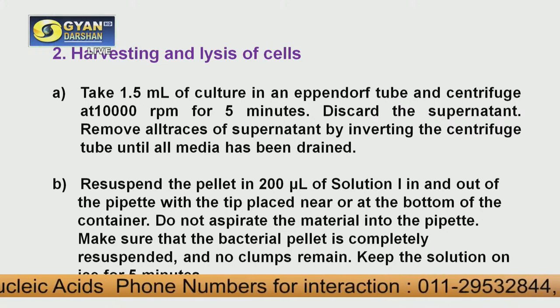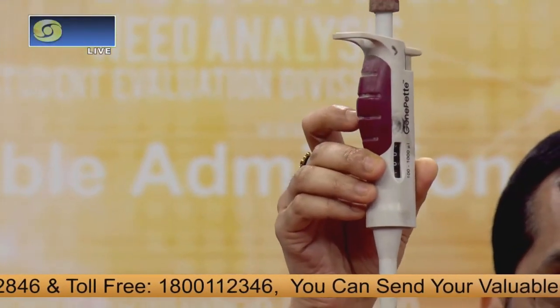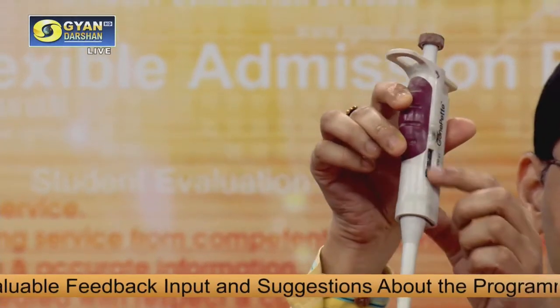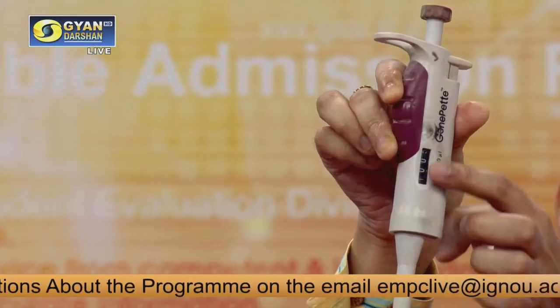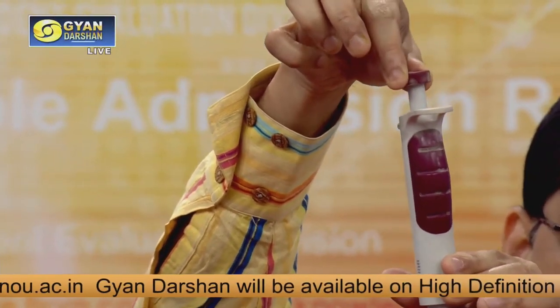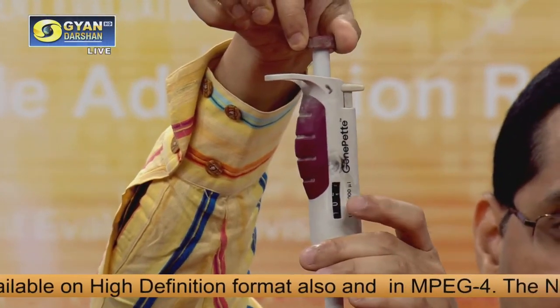Now in this context I will show you how to use this particular instrument, which we call the pipette man, or micro pipette. This is the micro pipette. You can set how much. There is a particular groove here that shows how many microliters you are pipetting. You can rotate this and set it, and it will show the readings of how much you are actually pipetting. So you can change it.